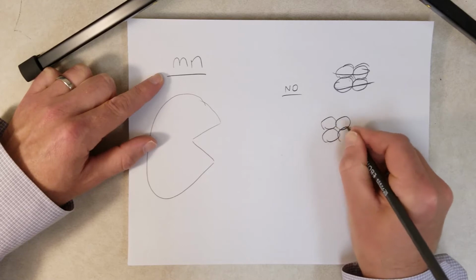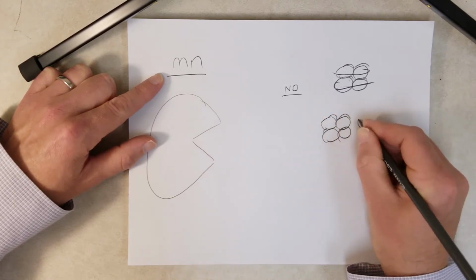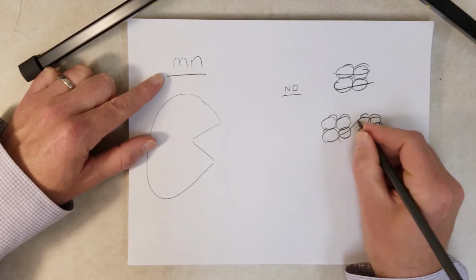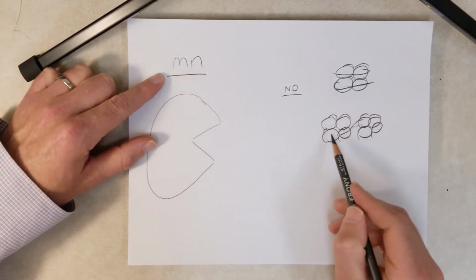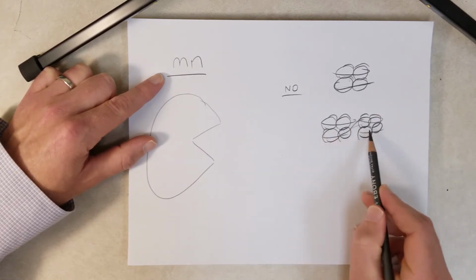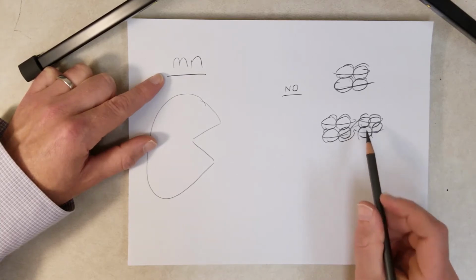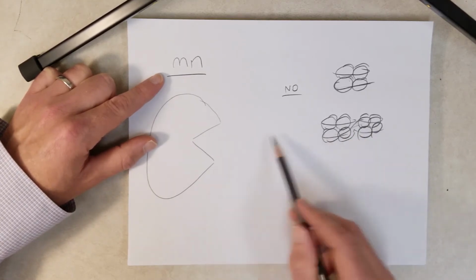So how about this right here? I have two octamers, and then I have just a little linker between them. And it's not very good at digesting the DNA associated with the octamers, or that little linker between there, because it's kind of wedged in here. It can't get to that DNA.